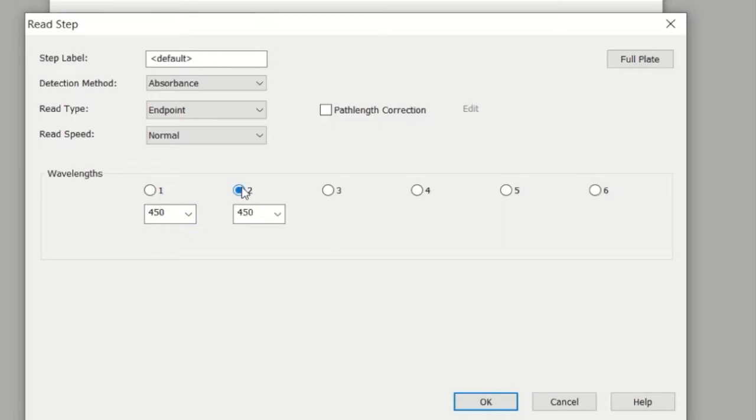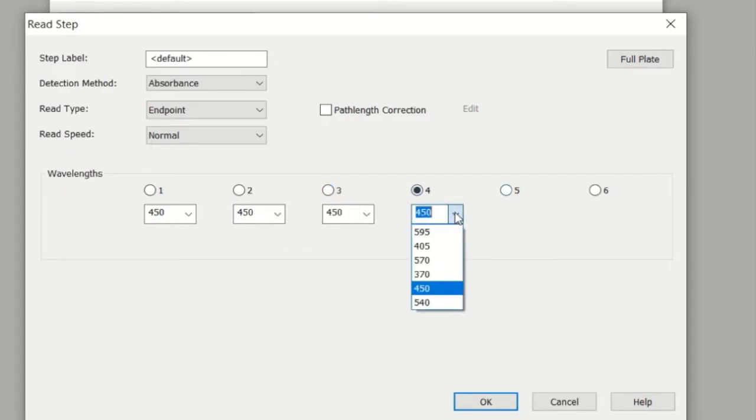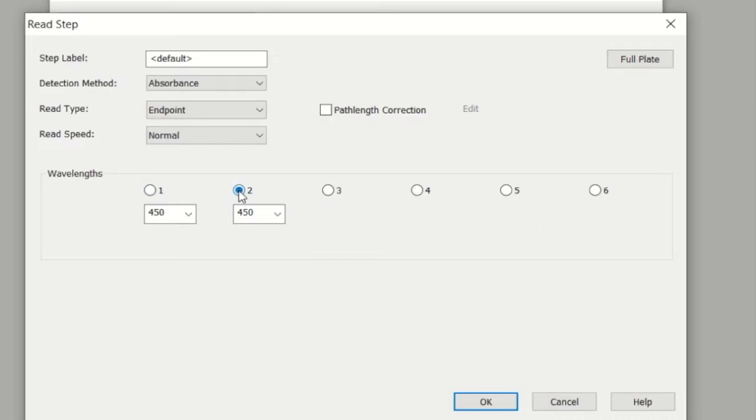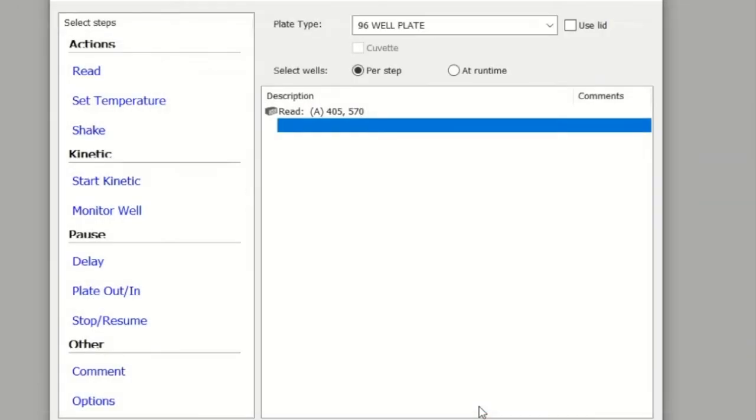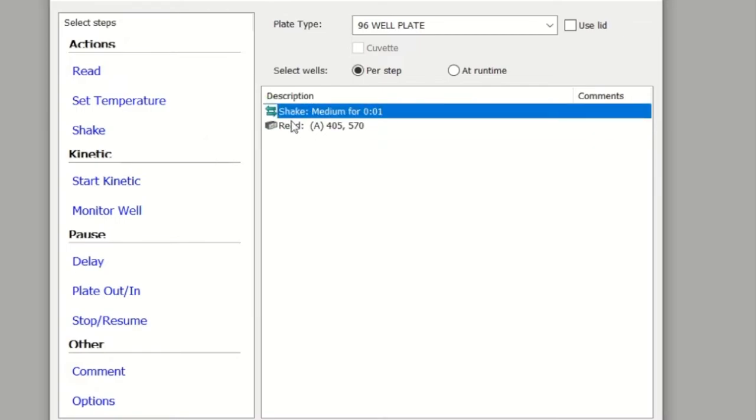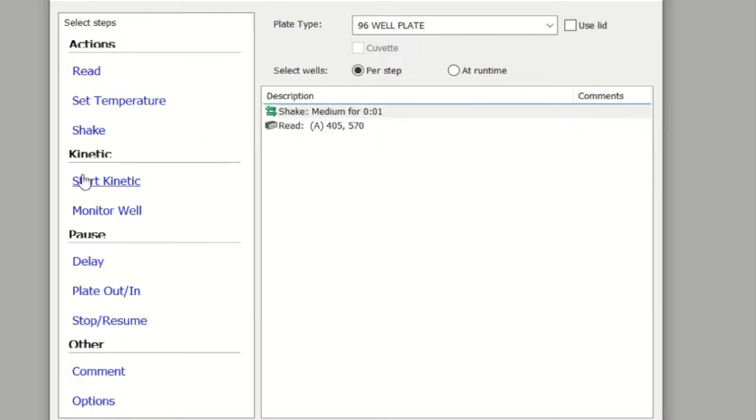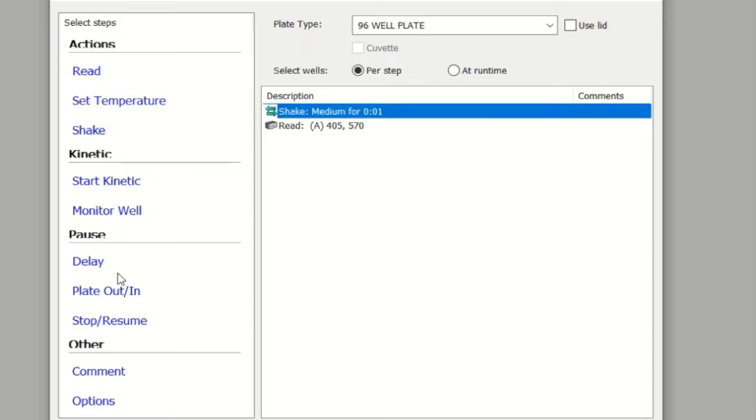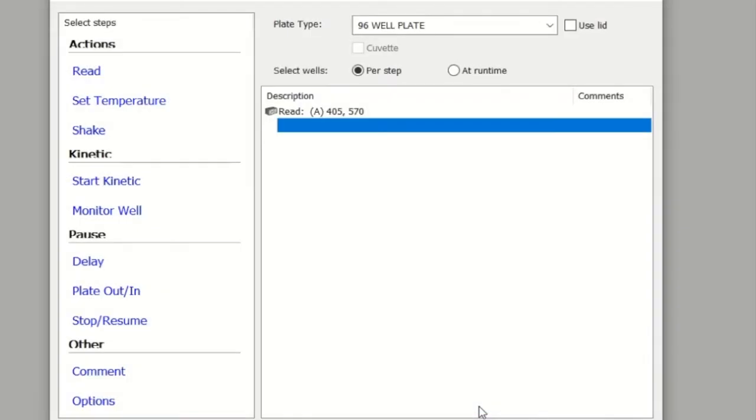The important part is the wavelength that you want to do the read at. You've got a range of wavelengths depending on the filters that you have. I'm going to select 450 nanometers for my read, but you've also got other wavelengths. You may want to do a quick shake before it reads. Just be careful to put the shake option ahead of the read because if you put it after, the software will complain.